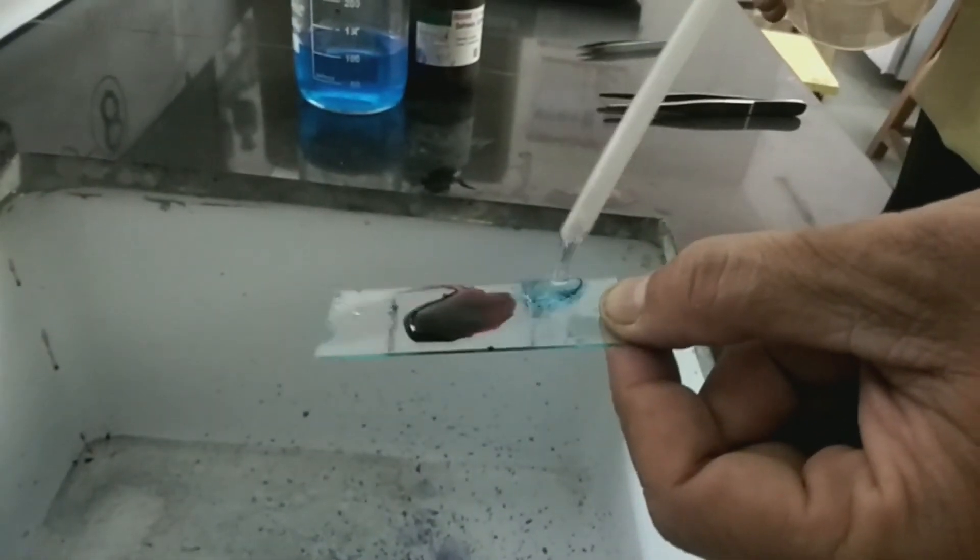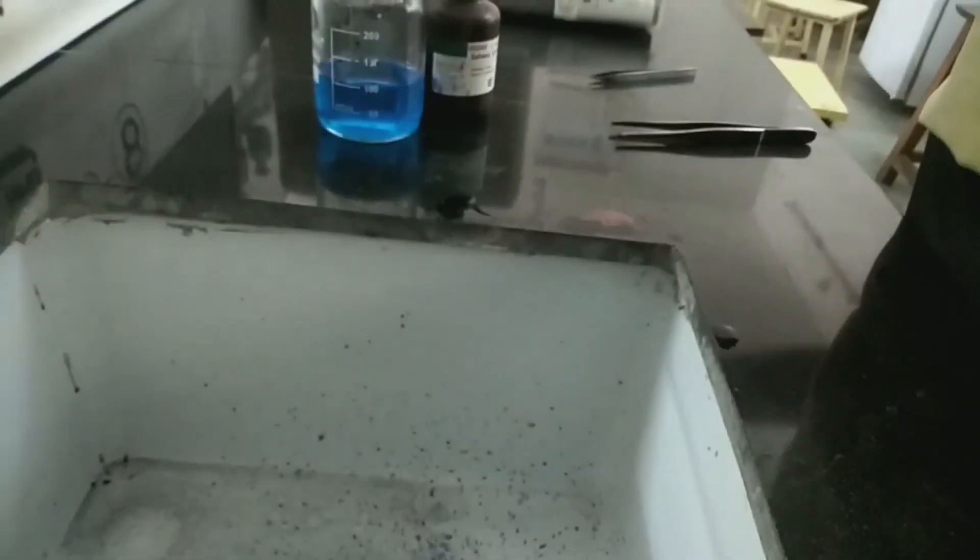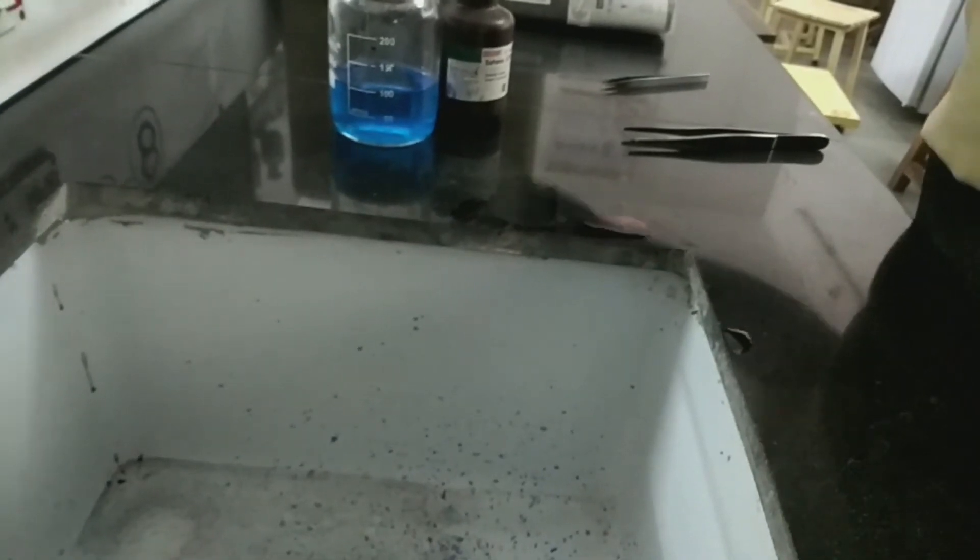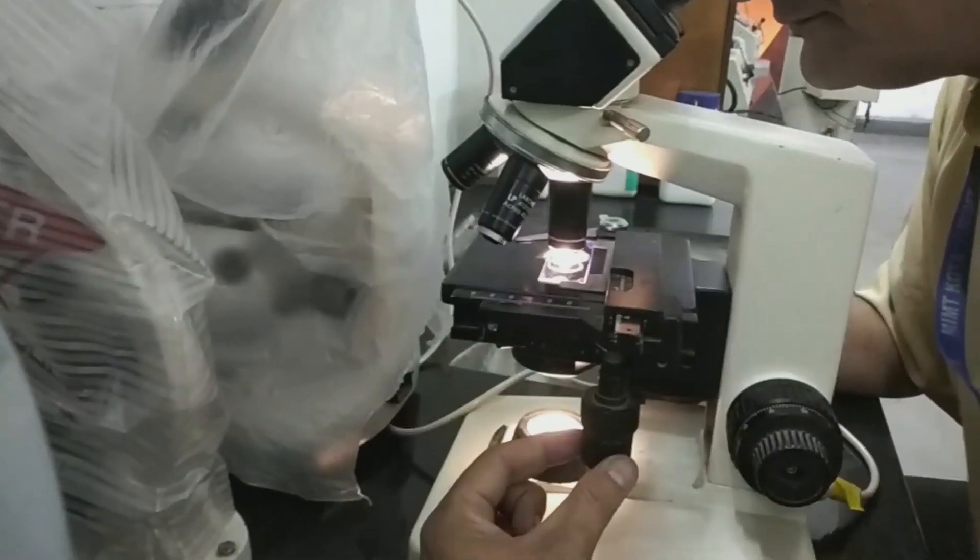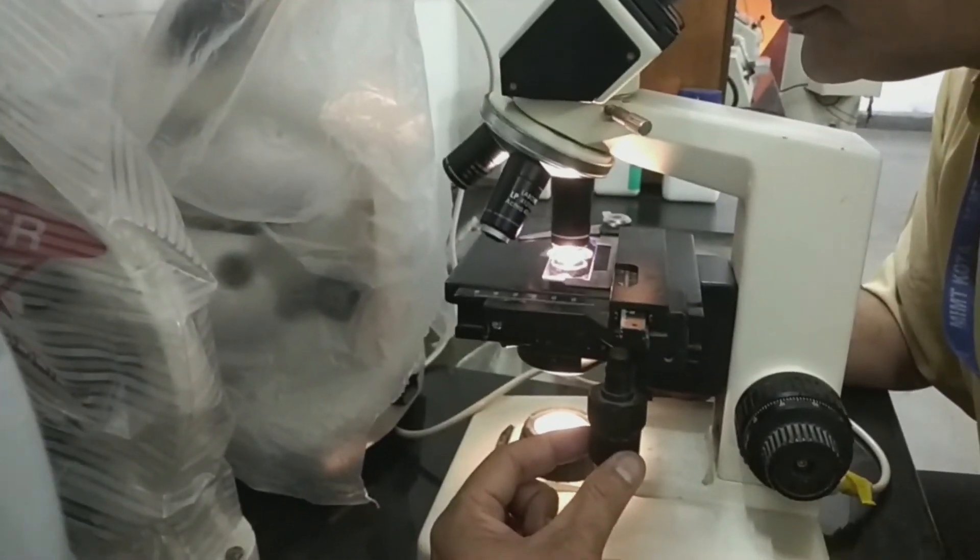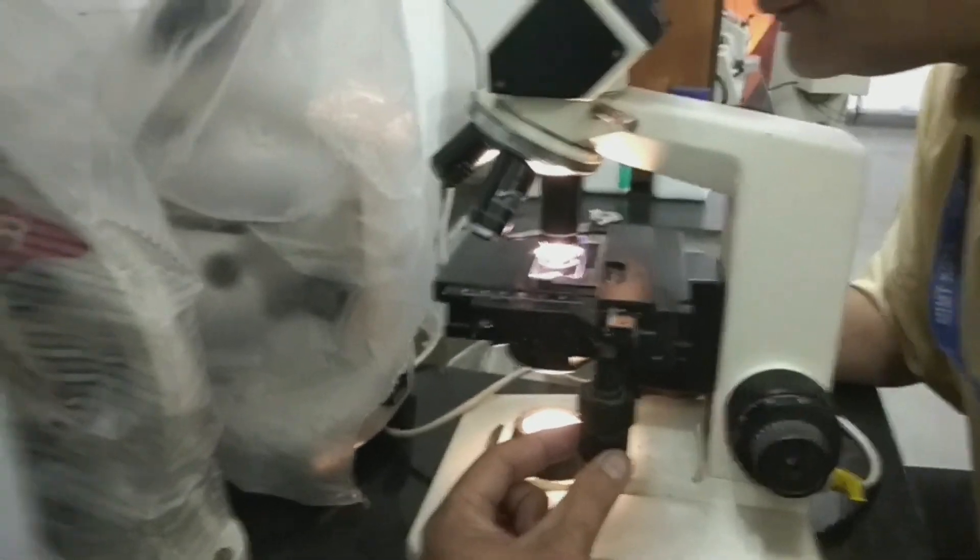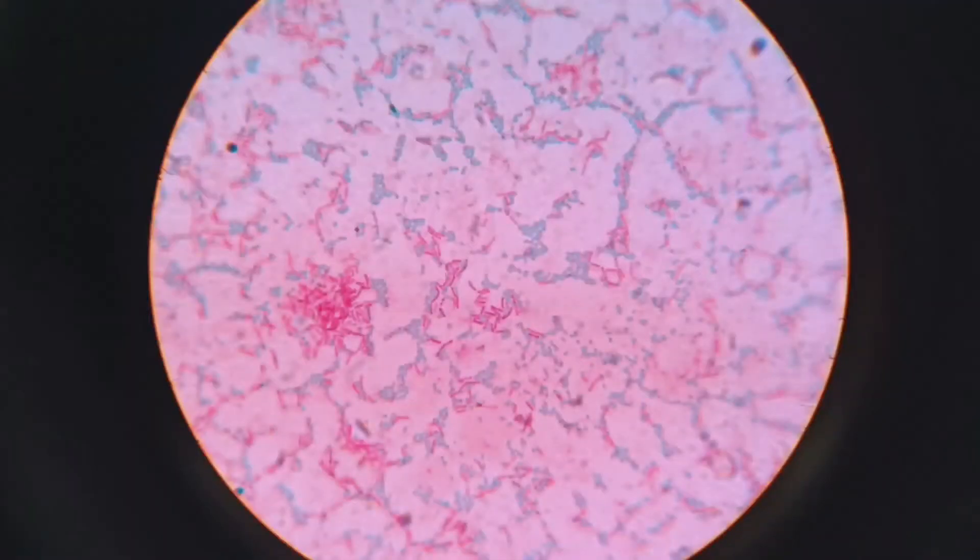After 30 seconds, wash the safranin with distilled water carefully. Be properly careful because if excess safranin is here, you are not getting the proper shape of the bacteria also. After that, visualize the slide under microscope under 100x power and you can see the result as follows.